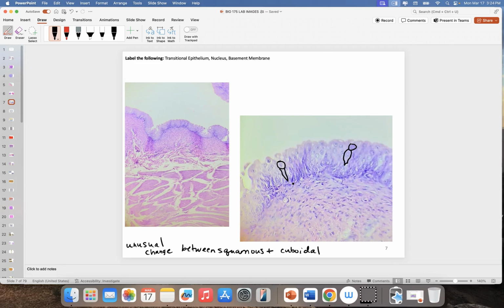If we are trying to find this epithelium underneath the microscope, we want to look for the apical surface, which again is the space or the free surface. So we can see that here and here as well. And that means that this then is going to be our epithelium. And what I've done is I've given us a view that's not as enlarged. That way we can really take it in. And then I've blown up so we can really zoom in on that epithelial layer.